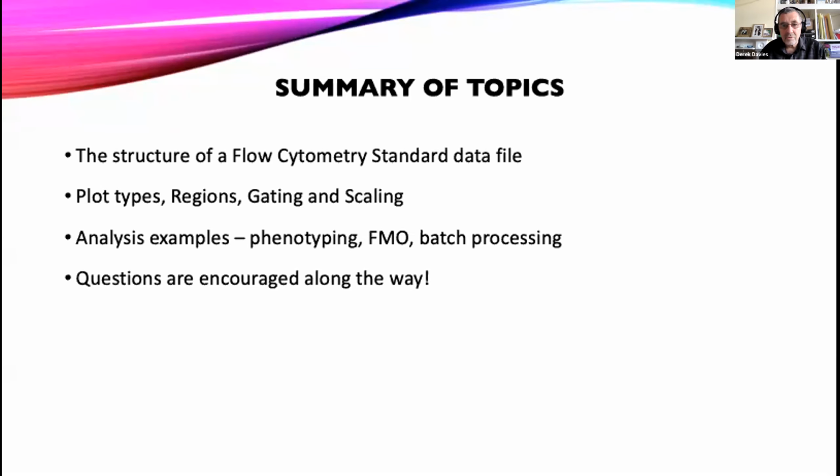And if we don't run out of time, we might look at some of the outputs, the sort of batch processing that we can do. And as we've said, questions are definitely encouraged along the way.